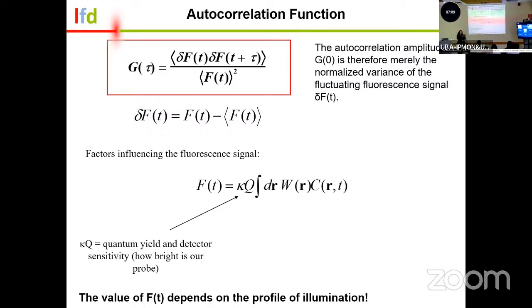So if the environment changes, then the quantum yield can change. And I think Professor Dave Jamieson may have shown some examples of, let's say, adding, what was the most famous one? The temperature change of, yes, exactly. NADH is a perfect molecule to talk about quantum yield.